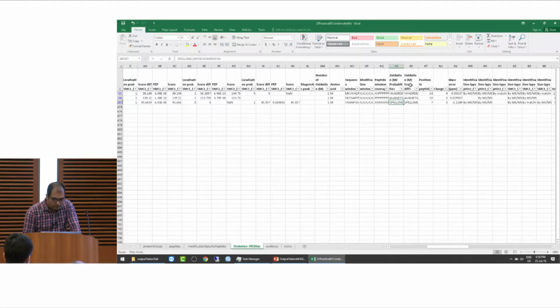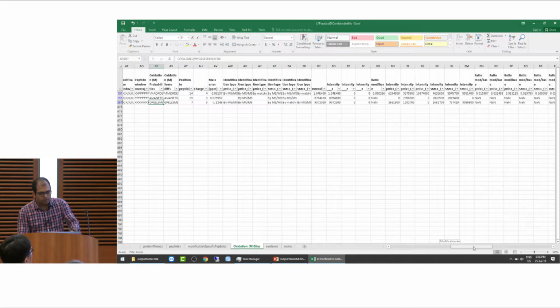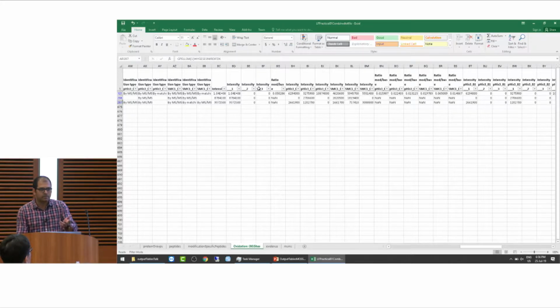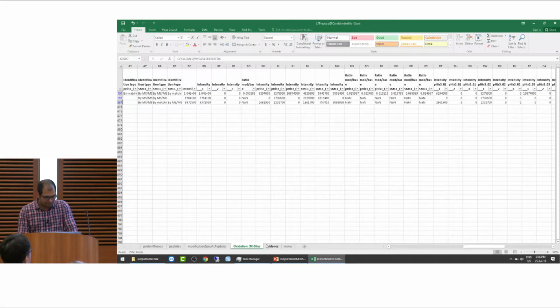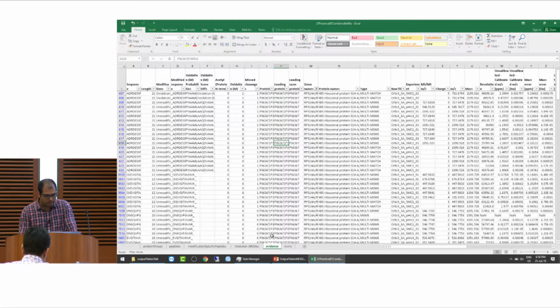And yeah, it's a bad example to show something less than 1 because most of the methionines are modified, right? And again, it's the same kind of continuity about identification type, intensity. I think intensity 1, 2, and 3 probably Kirti will cover what they are. And yeah, if we take one particular site information, then we can have a lot of evidence.